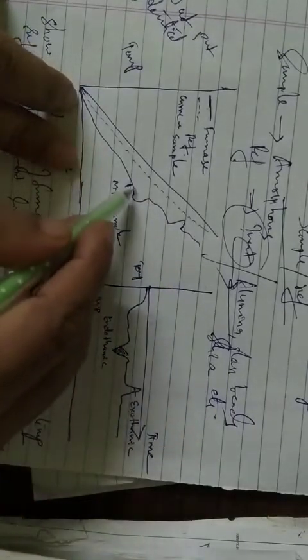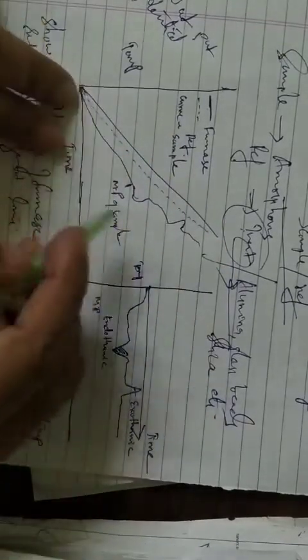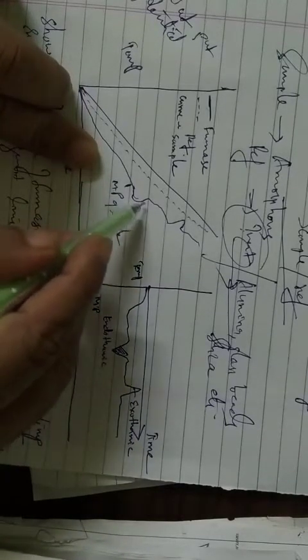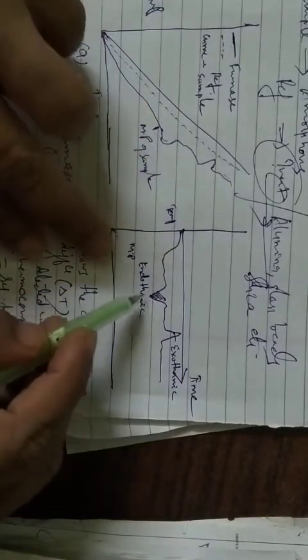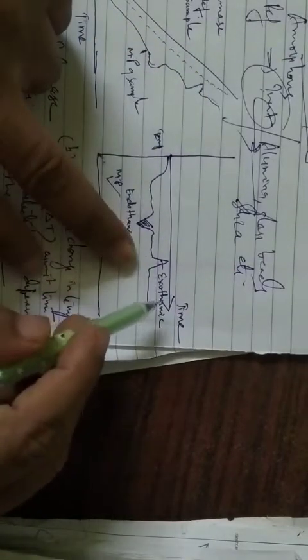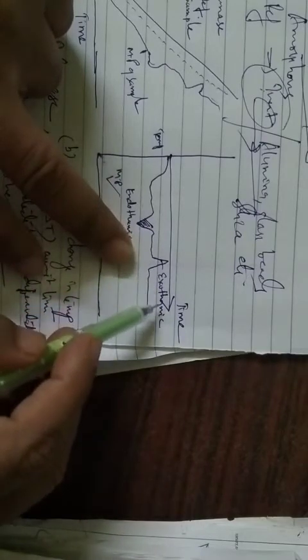Now we get the downward peak here because as we increase the temperature, the sample reaches its melting point, and slowly it increases. In the differential, this decrease in the peak is nothing but the endothermic nature, where you can see the melting point is formed. Then the exothermic reaction: after decomposition, the product we get comes as a positive peak here, so we term it exothermic.